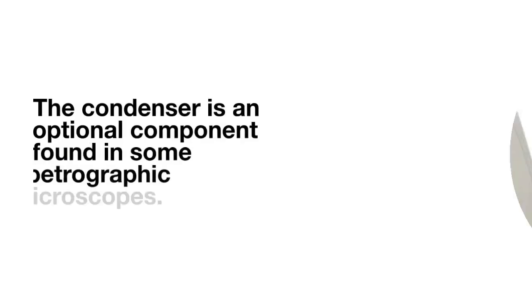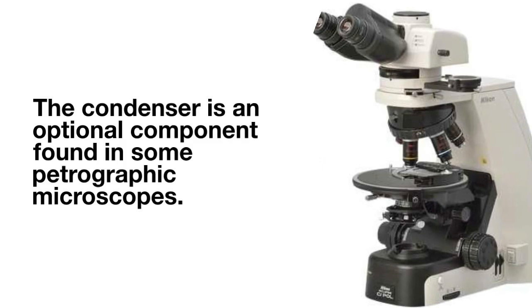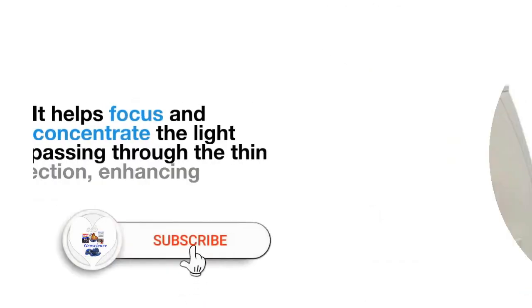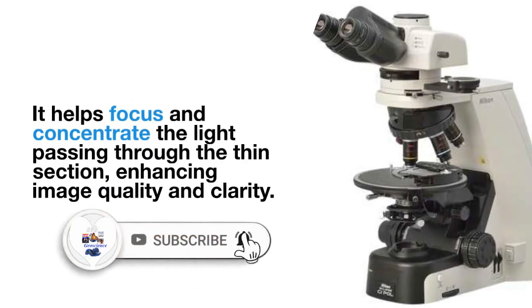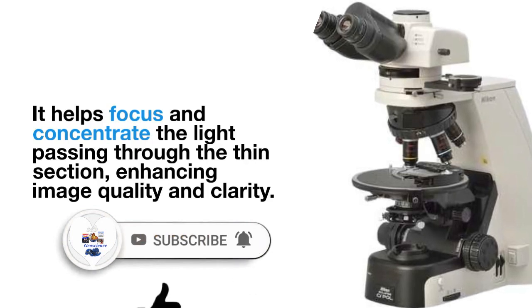Condenser. The condenser is an optional component found in some petrographic microscopes. It helps focus and concentrate the light passing through the thin section, enhancing image quality and clarity.